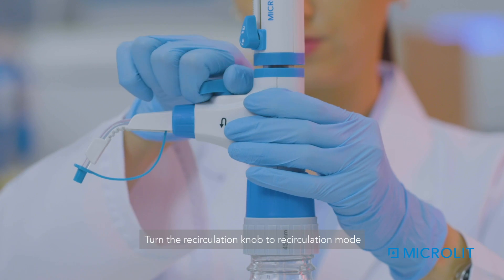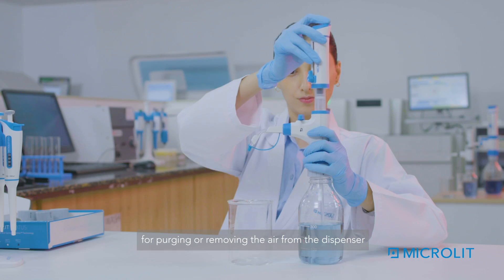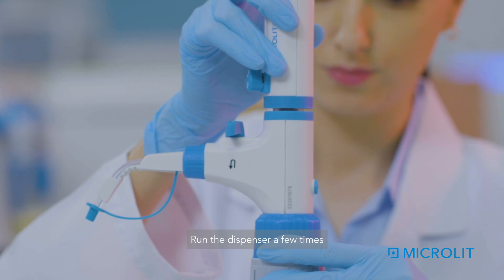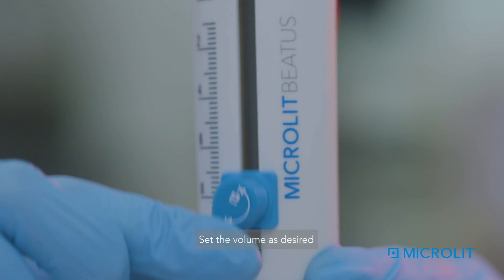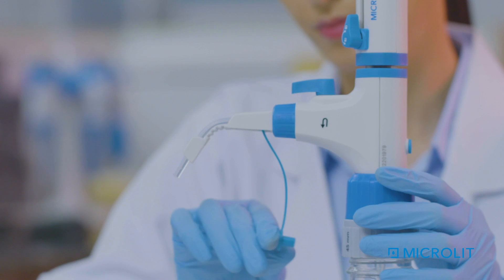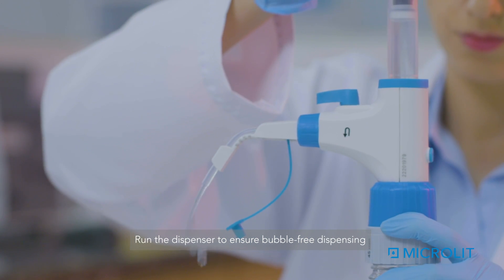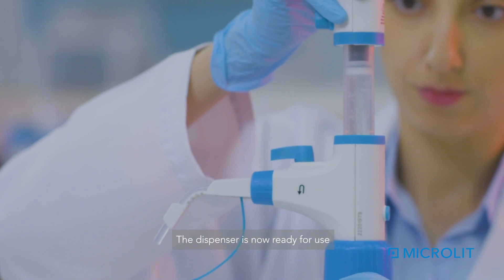Turn the recirculation knob to recirculation mode for purging or removing the air from the dispenser. Run the dispenser a few times till the barrel is bubble-free. Set the volume as desired. Turn the knob to the dispensing mode. Run the dispenser to ensure bubble-free dispensing. The dispenser is now ready for use.